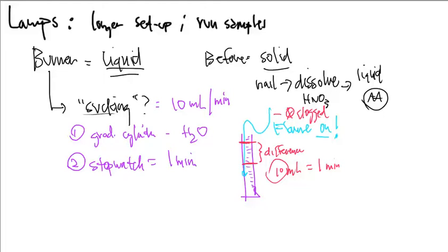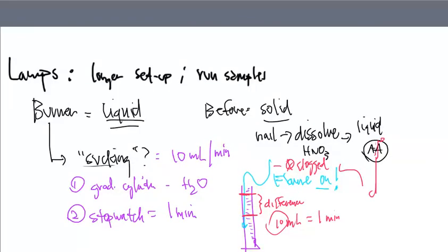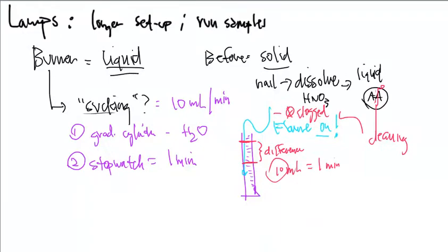There is a cleaning wire that you can use, and that cleaning wire is a very thin piece of metal that fits perfectly down into the nebulizer tube. And that's what we call the piece of plastic. It's called the nebulizer tube. What is the nebulizer? We'll find out in just a second. Okay, so I would stick this cleaning wire down into the nebulizer tube, make sure that it's not clogged up.